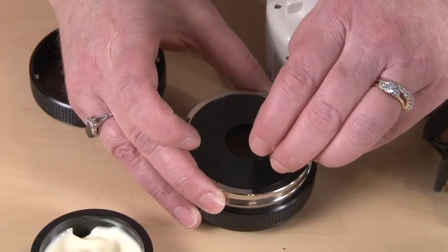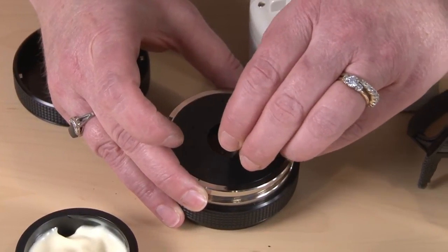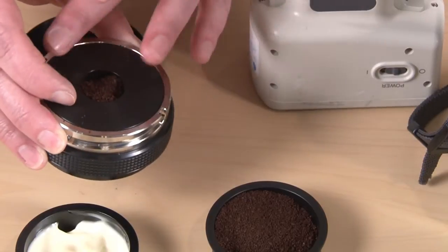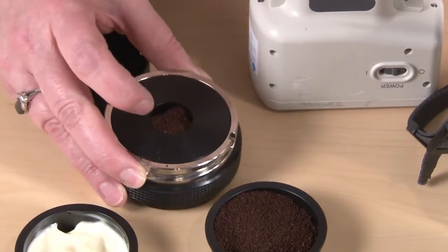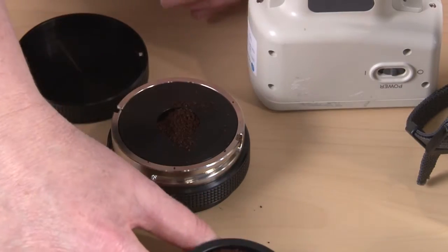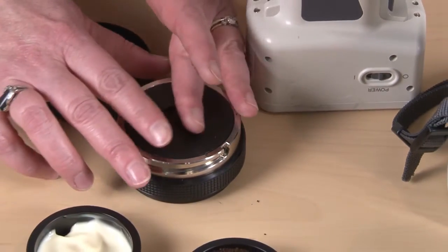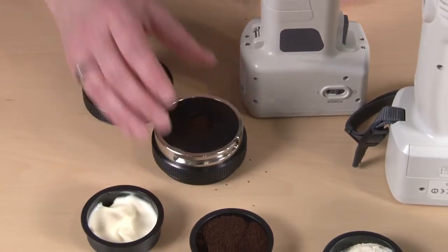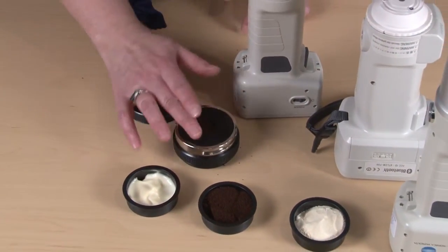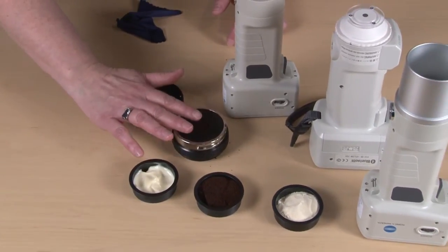Depending on the granularity of your substance, it will determine which one of these three instruments — the 400, 410, or 700 — would be the best for consistent readings. Once you have the right amount of the sample in the ring, you want to tap on it just a little bit to get any air bubbles out and to provide a consistent sample for the instrument.